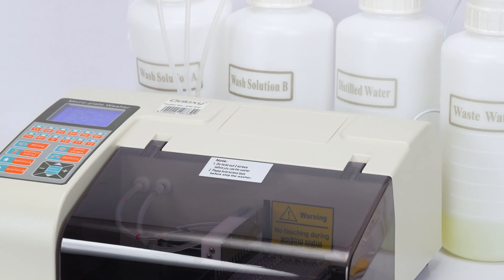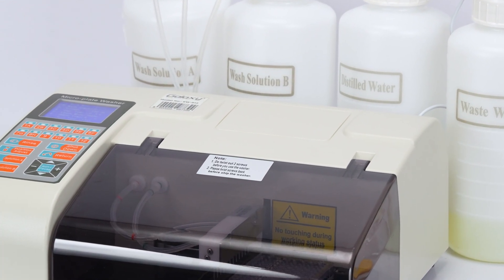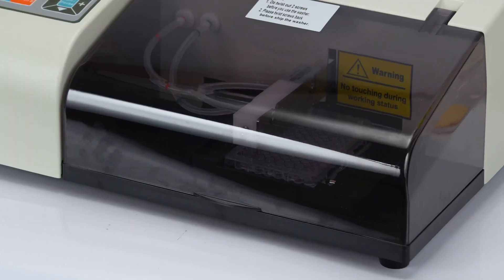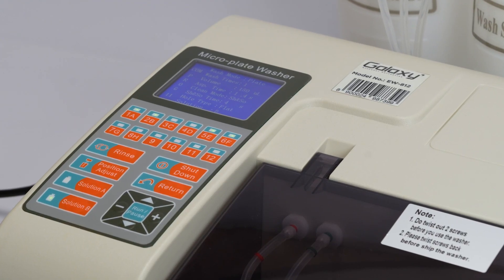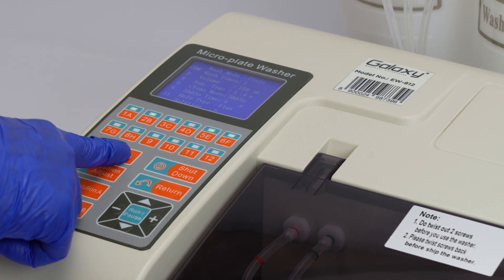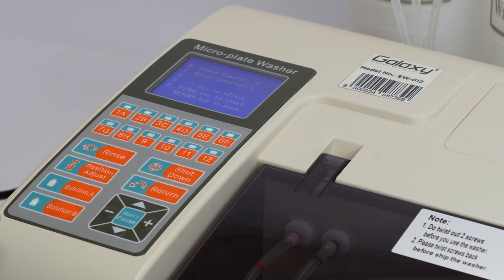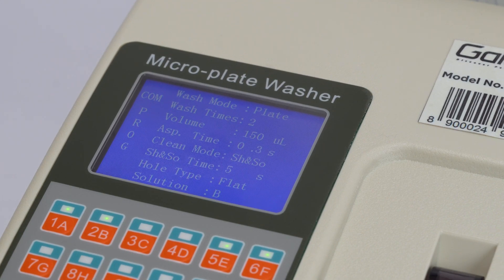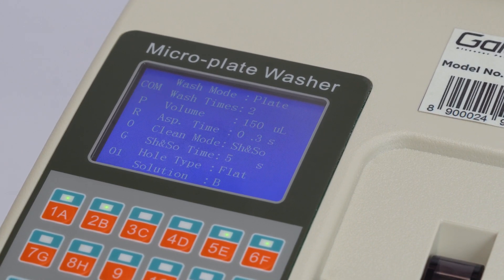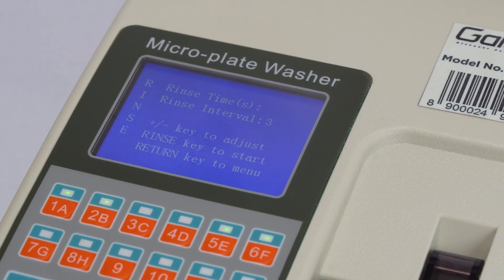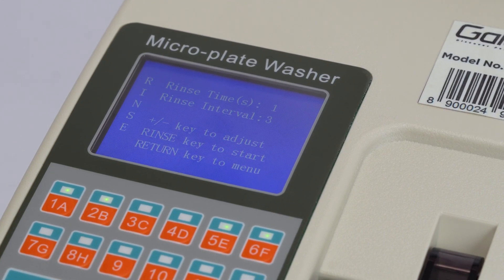To keep your EW812 performing optimally, after the washing process is complete, press the rinse pipe button to prevent the cleaning head and pipes from clogging or crystallizing. When you press the rinse pipe key, the screen will show the rinse pipe time, 1 to 240 seconds, adjustable with the plus and minus keys.